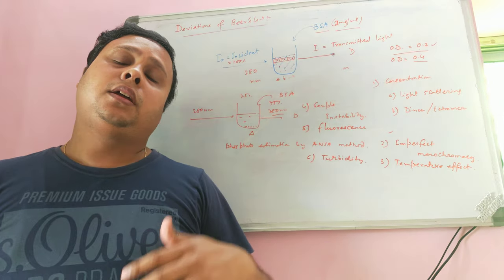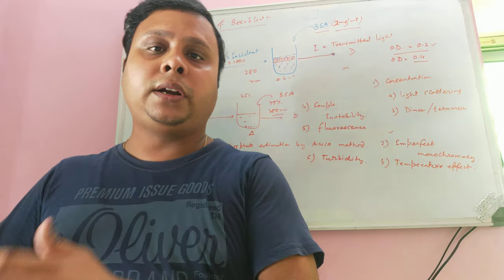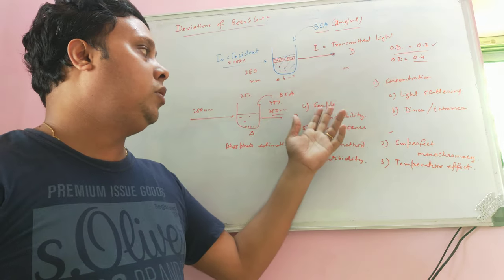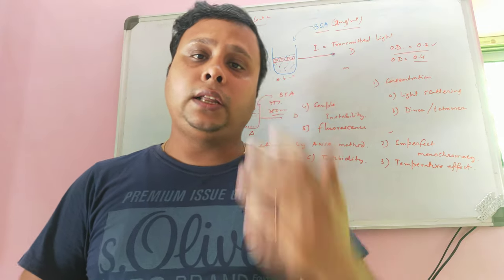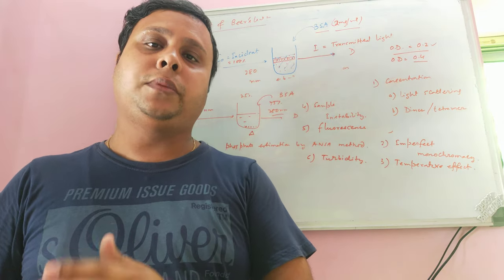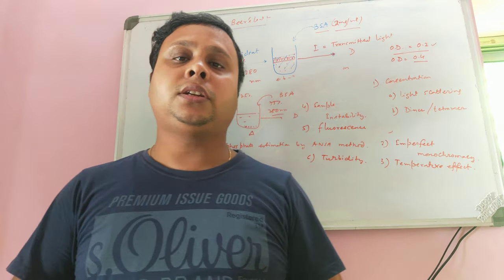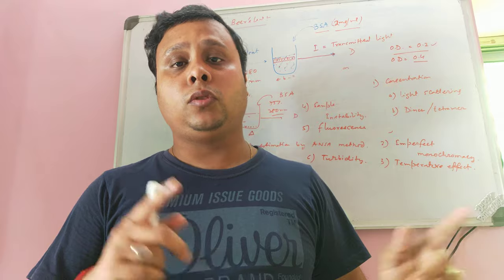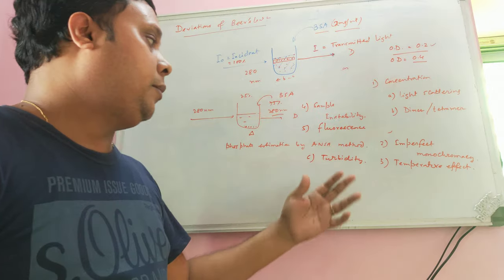Fourth, sample instability — after color development in unstable complexes such as in the ANSA phosphate method, you must immediately take the OD reading. Fifth, fluorescence — fluorescent molecules absorb at one wavelength and emit at a longer wavelength, causing the detector to receive two different wavelengths and giving an incorrect OD. Sixth, turbidity — turbid solutions absorb more than native solutions due to additional particles such as microbial metabolic waste products.